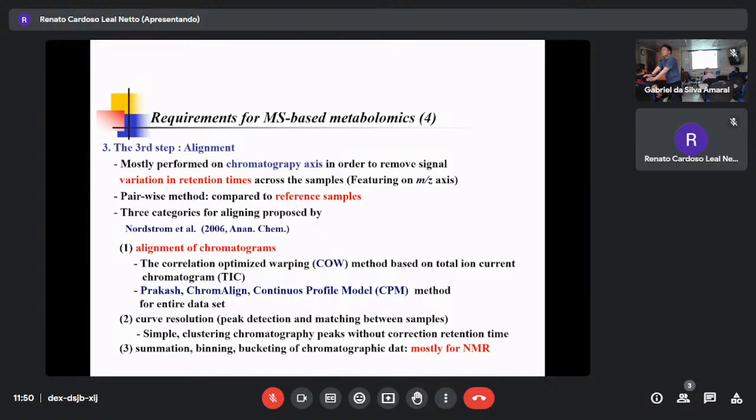Of course, if you are using only one sample, no problem because you know this signal, but you have 1,000 spectra. I told you data processing is where you put the name. Now he is at 10 minutes, like Maria. But tomorrow he changed to Mario. Then it's a completely different one, right? That's why alignment is always very important. How does it look?